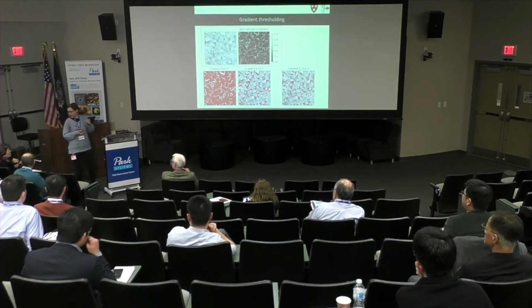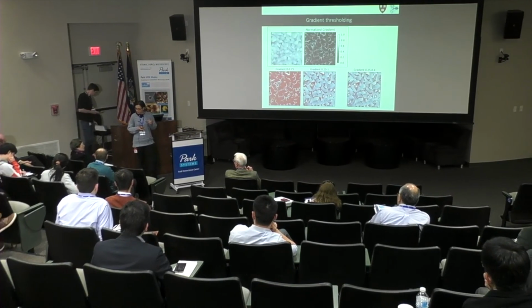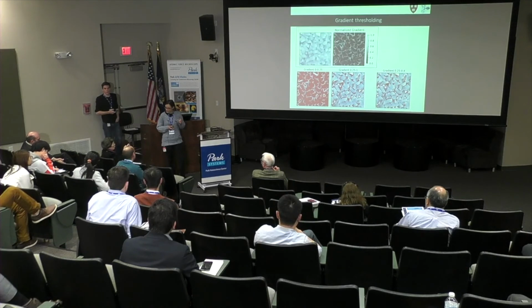May I make a comment? Yep. I think it's very nice. I understand your purposes without doing all this other experimental work, just using your methodology to find out preferred orientation. But I think the edge may not represent the real crystallography orientation, because there's a whole community talking about epitaxy and what's a preferred orientation.